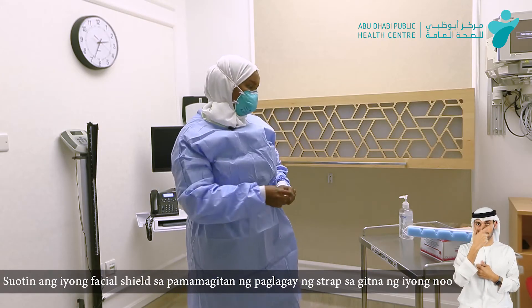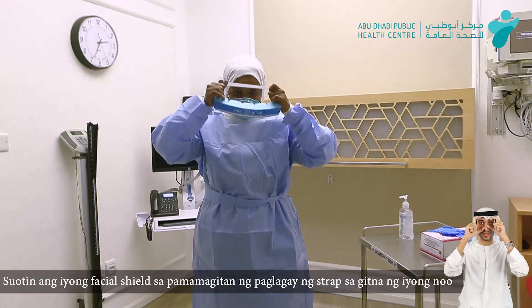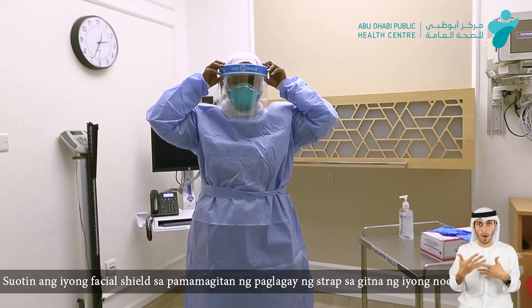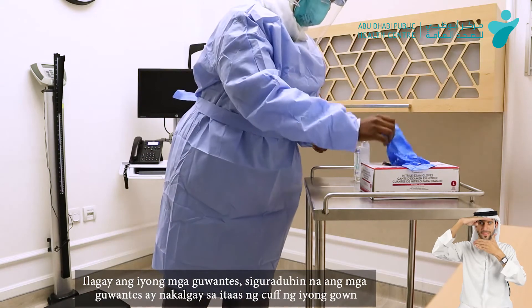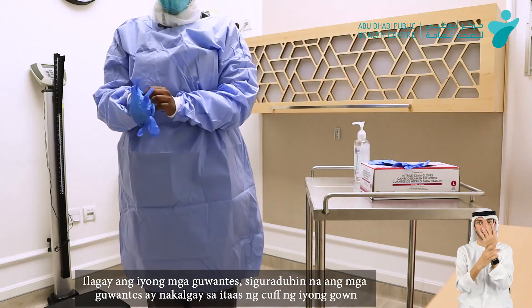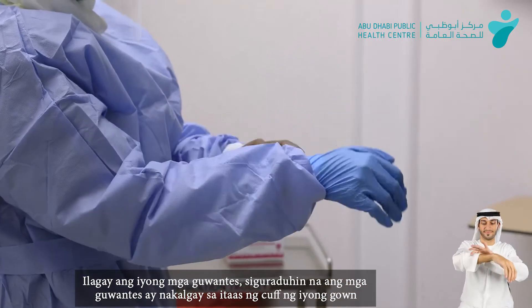The third step is going to be using the face shield. This is stretchy — I secure it on the forehead to the back, making sure that it's in the middle of my forehead and covering properly. The last step is going to be the gloves, using fitted gloves. Make sure that it covers till the cuff of my gown.